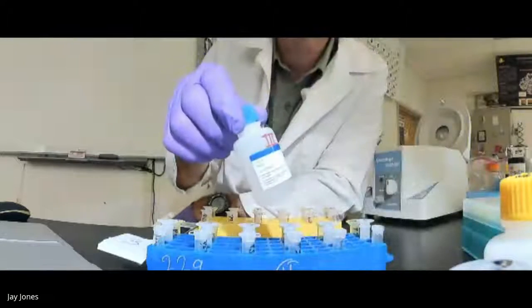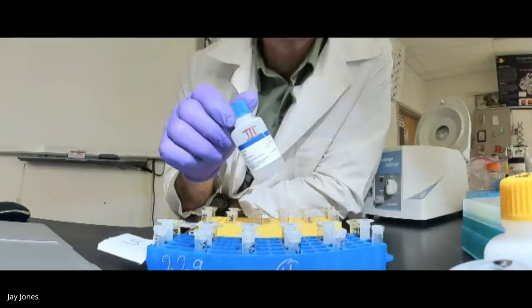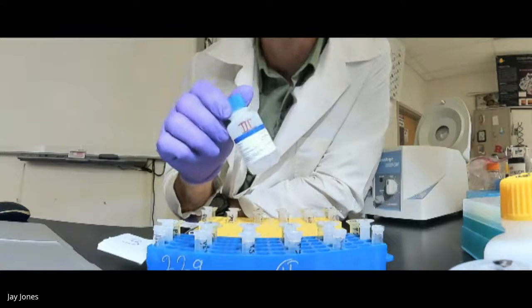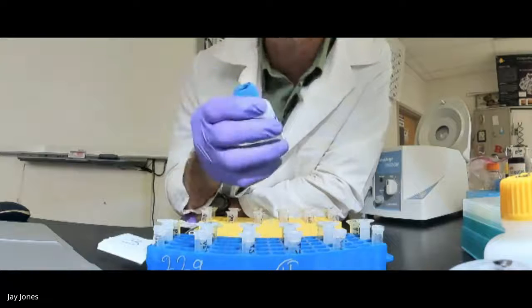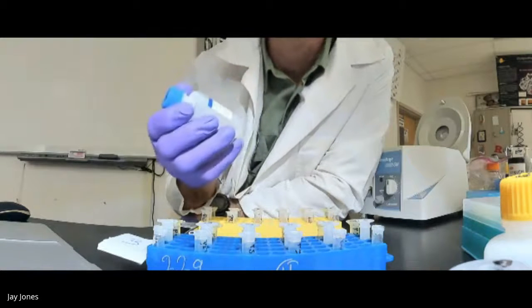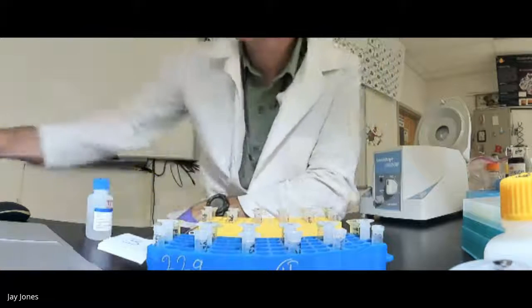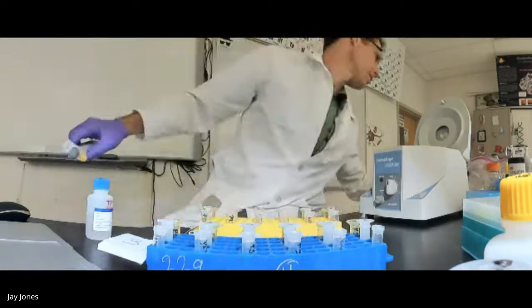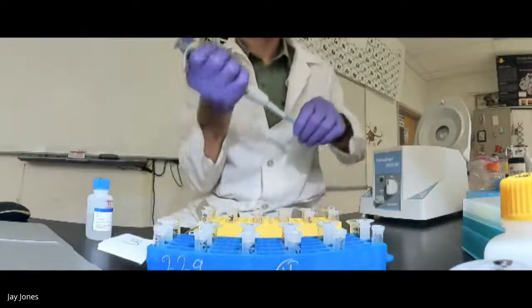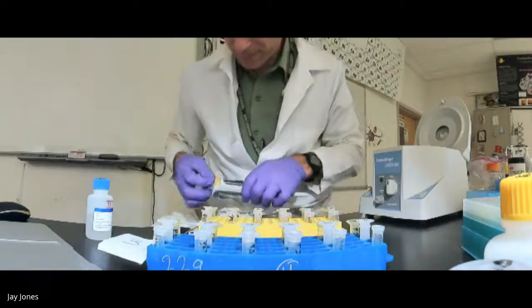Let's do solution three. Now, solution three is the opposite of a soap. It's an acid. It's potassium acetate and acetic acid. We're bringing the pH back down to neutral. It was really basic. Now we're bringing it back down to neutral. Let's do it. Solution three, my volume, which is not super important, is 350. Get rid of that tip. Don't want to use the tip again. Let me dial to 350.